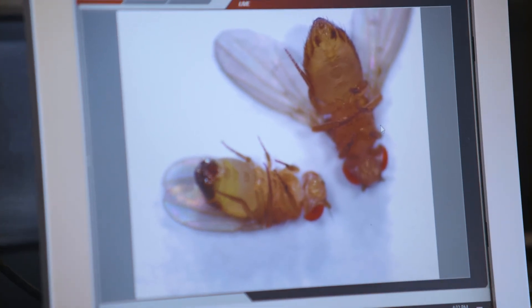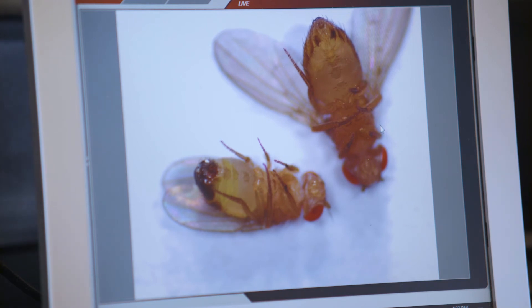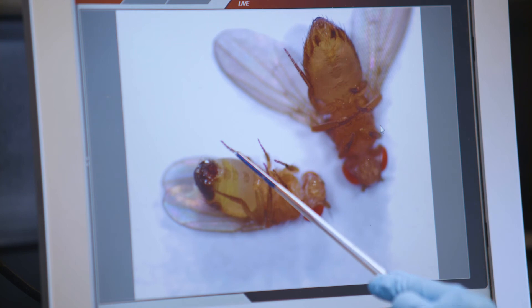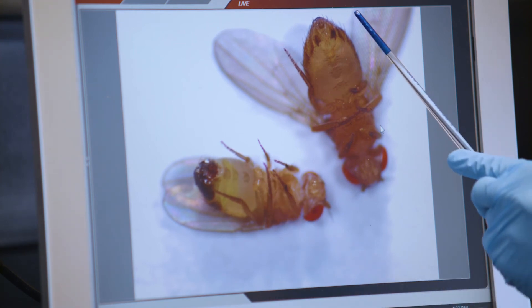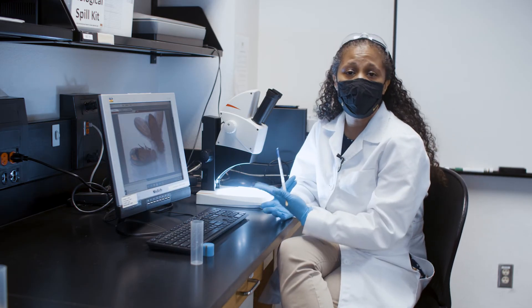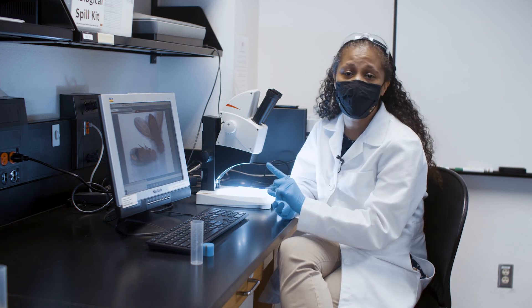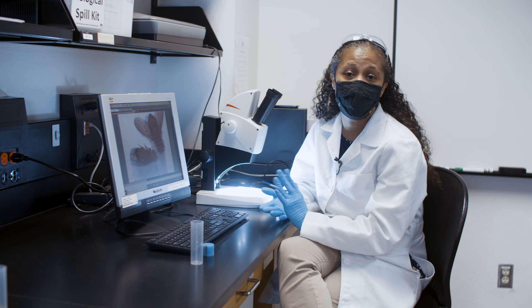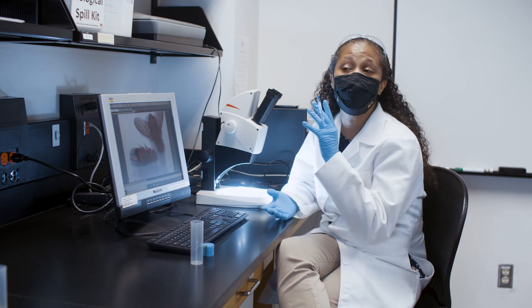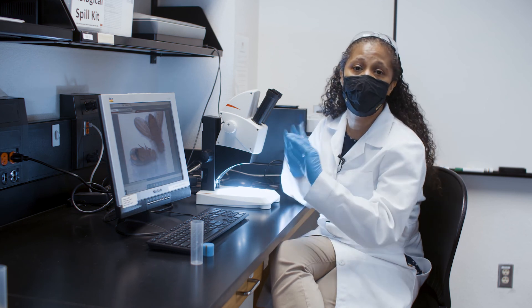If you flip the flies over you can also examine the external genitalia, which is going to be one of your more reliable markers. The male is going to have external genitalia whereas the female is not — she's going to have a relatively smooth abdomen all the way down to the tip. Your two most reliable markers when sexing flies are the presence of the sex combs and the appearance of the external genitalia. Use multiple characteristics to ensure you're properly separating males and females.